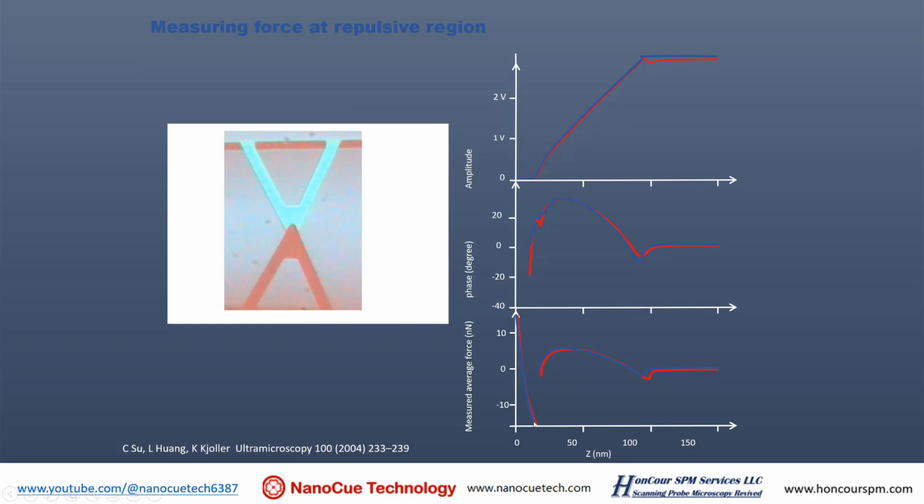And when it's below 40%, 20%, 10%, the situation is no longer true, right? It becomes more complicated. So we always try to avoid lowering your set point too low. When it's too low, the force is no longer kind of under control, basically. Yeah, it gets more complicated.